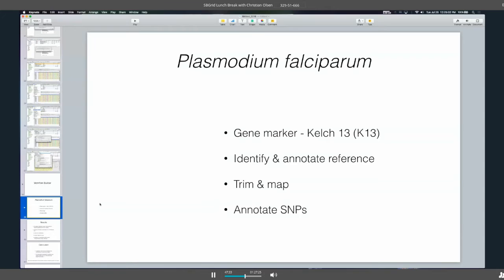Okay, and it's a fairly small workflow. These can get as complex or as simple as you want. And I would recommend start out simple. And if you need help with workflows, please send me an email and let me know. Sometimes they're intuitive and sometimes they're not, depending upon the person.